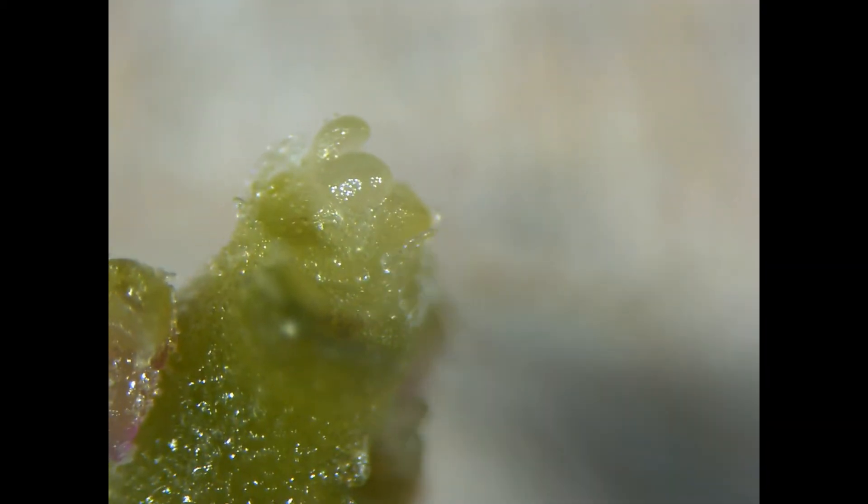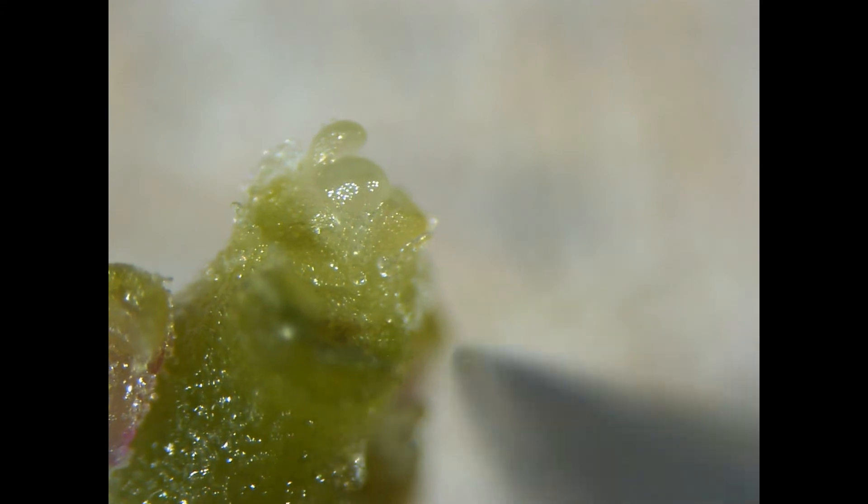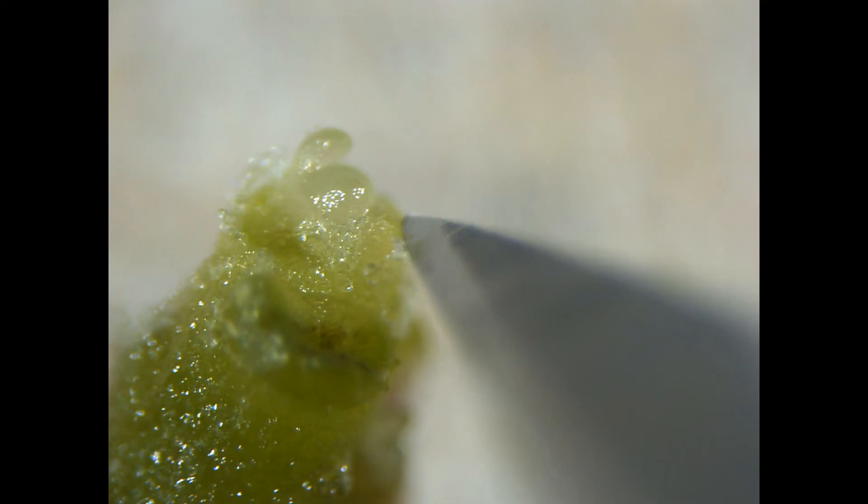Sweet potatoes are unusual in that it's possible to excise just the dome if you want to — it's usually about 0.1 millimeters. But when you include a few leaf primordia, the survival increases and it's usually small enough to exclude the virus.